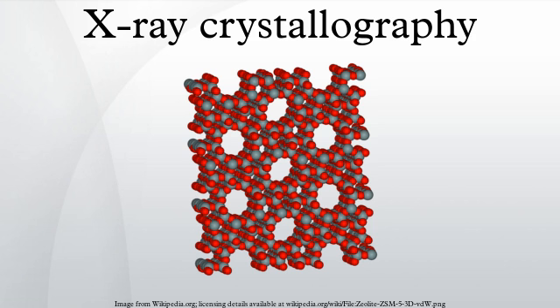This is an example of constructive interference. In a liquid, powder or amorphous sample, molecules within that sample are in random orientations. Such samples have a continuous Fourier spectrum that uniformly spreads its amplitude, thereby reducing the measured signal intensity, as is observed in SAXS. More importantly, the orientational information is lost. Although theoretically possible, it is experimentally difficult to obtain atomic resolution structures of complicated, asymmetric molecules from such rotationally averaged data. An intermediate case is fiber diffraction, in which the subunits are arranged periodically in at least one dimension.